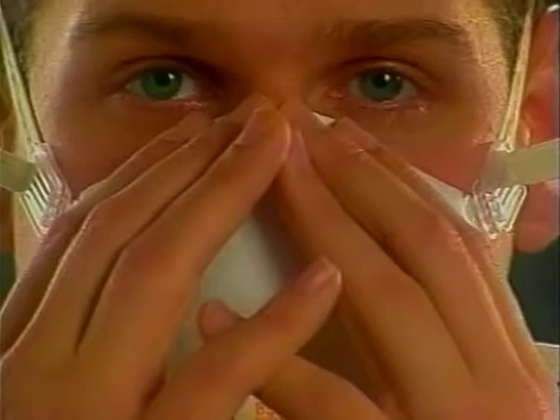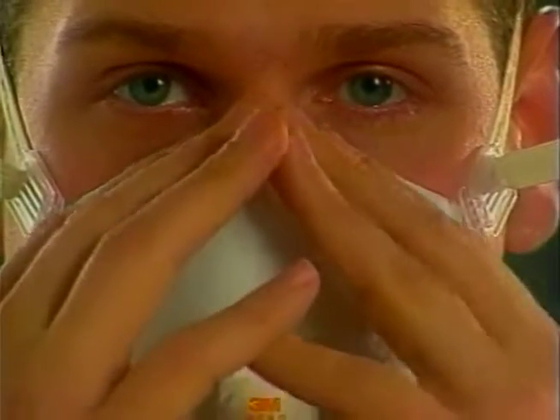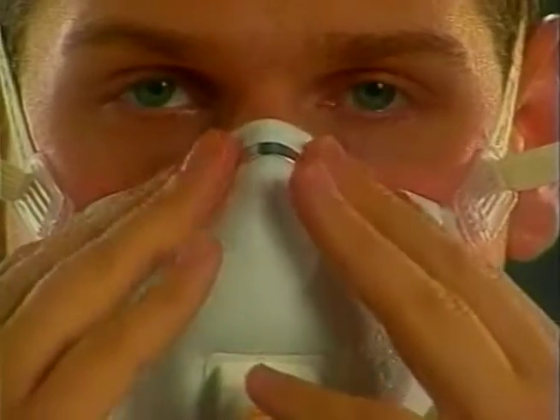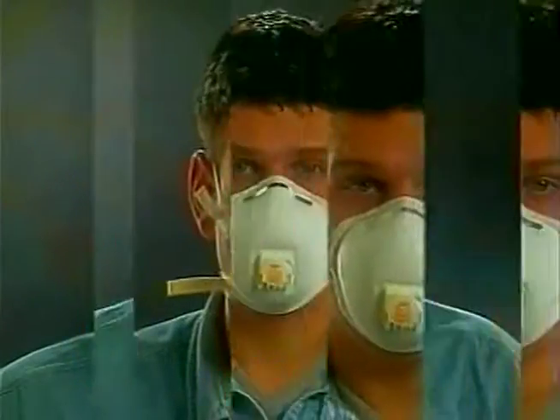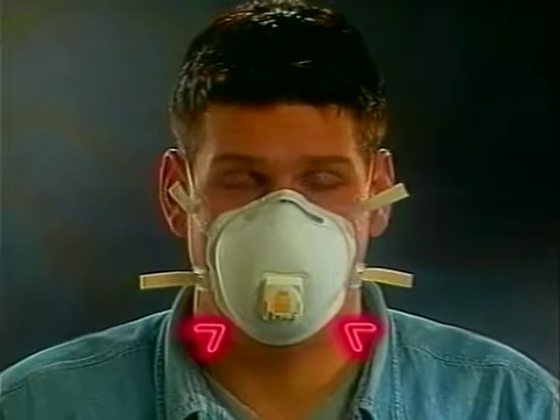Now, place the fingertips of both hands at the top of the middle nose piece. Using two hands, mold the nose clip to the shape of your nose by pushing down on both sides. Using one hand may result in improper fit and less effective respirator performance. It is essential to wear both straps. Using only the top strap will allow air contaminants to enter around the bottom of the respirator, seriously compromising your protection.